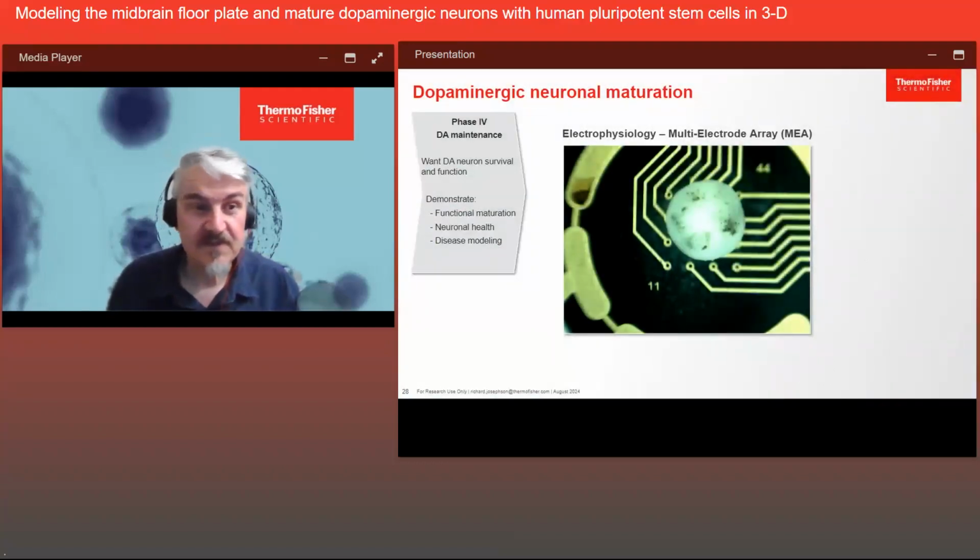To do this, we use a multi-electrode array, or MEA, to measure field potentials surrounding plated cells. An MEA can detect individual action potentials as well as coordinated network spikes across spatially separated electrodes. Typically, for neural organoid work, the organoid is dissociated early on to allow neurons to attach to the MEA individually.